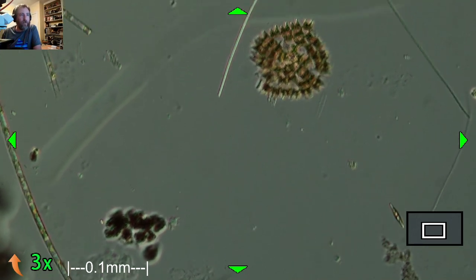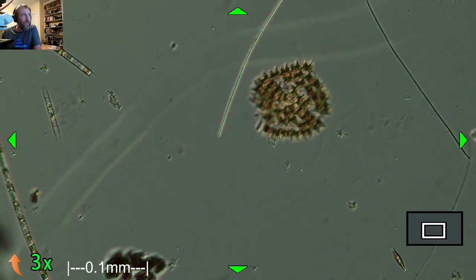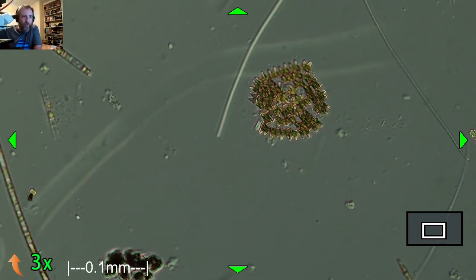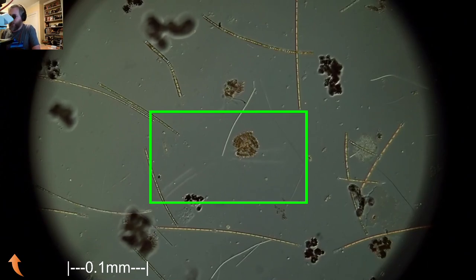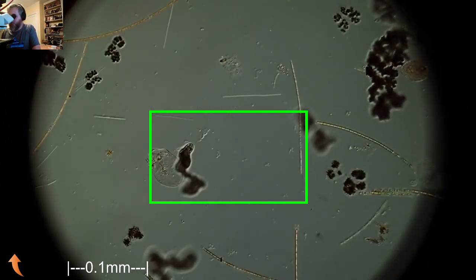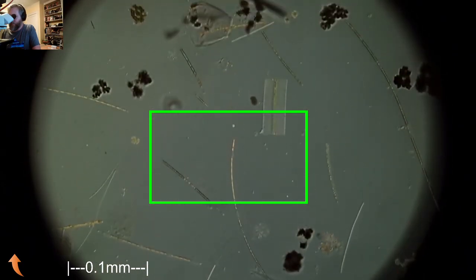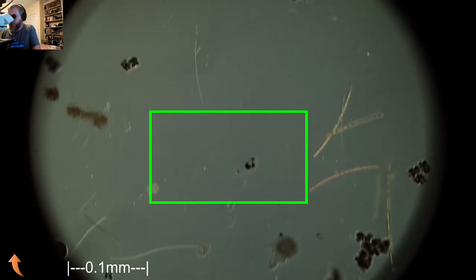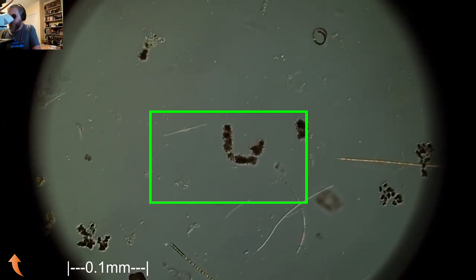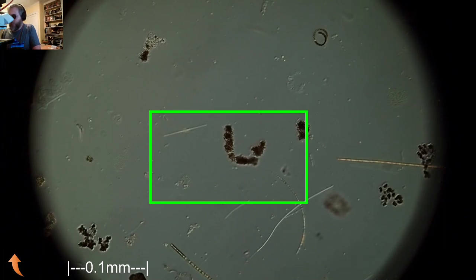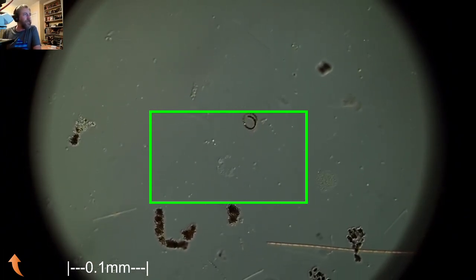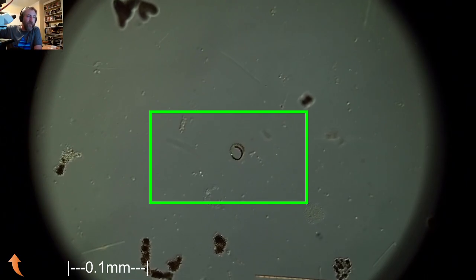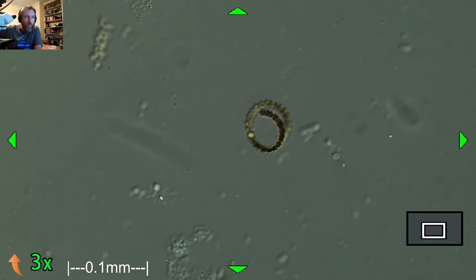And there's another Pediastrum right there. A link for what, Rod? Yeah, they used to be Clear Lake. Exactly. And the city is called Clear Lake, so they can't just rename it. Oh yeah, yeah, yeah, you can share a link, sure. You should be able to do that. Some more different types of Pediastrum. This thing right here, that little thing that looks a bit like a necklace or a bracelet, is Anabena.